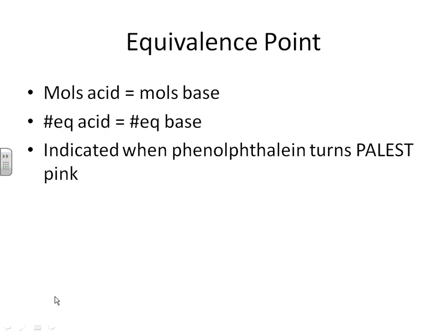Now, equivalence point. Let's start to get into some of the math behind it. I want to remind you about equivalence point. Now, in class, when we do calculations with titrations, we refer to the equivalence point as the point where the moles of acid is equal to the moles of base. In this lab, because we are dealing with normality, and normality is the number of equivalents divided by the liters of solution, I am going to use the actual technical definition of equivalence point, which is when the number of equivalents of acid is equal to the number of equivalents of base.